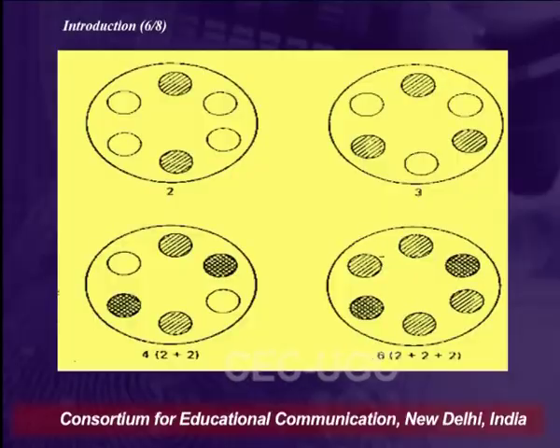The most important thing in centrifugation is balancing. As you can see in the first image, if we have 2 tubes in a 6 hole centrifuge rotor, we put them diagonally opposite. In a 6 tube system, if we have 3 tubes, we can put them in alternate positions. When we have 4 tubes in a 6 hole rotor, we put equal quantities opposite to each other. Similarly, in the 6 tube rotor, we put equal quantities opposite to each other. Balancing is the key in centrifugation.